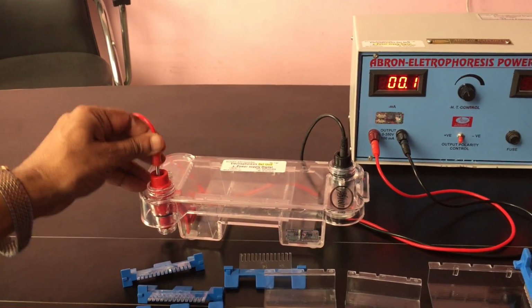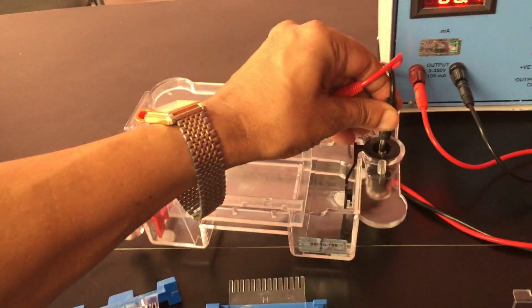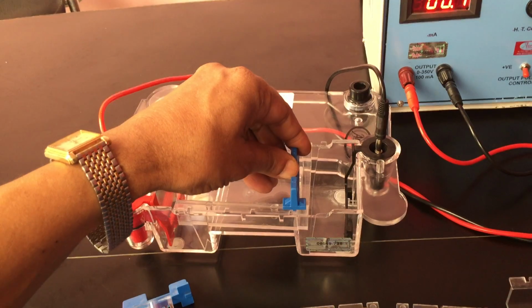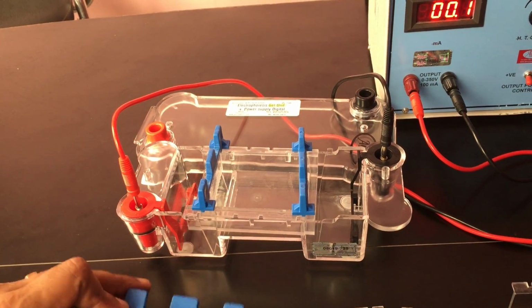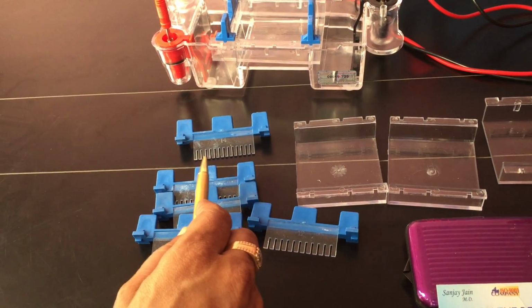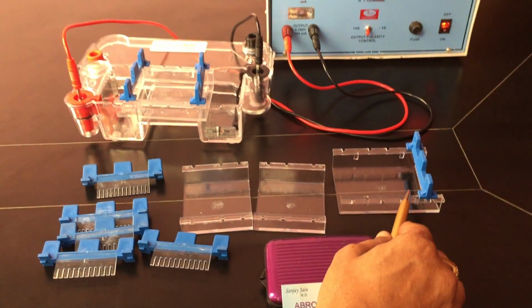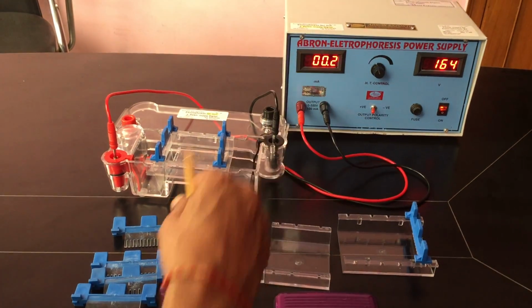We can connect from outside, or just take it out, connect it to this section, and put the gel combs here. There are two kinds of combs: this one has 14 and this one has 12. There are gel adjusting trays, and one more tray is there. There are two trays of this kind, two trays of this kind, wires, and then the full setup.